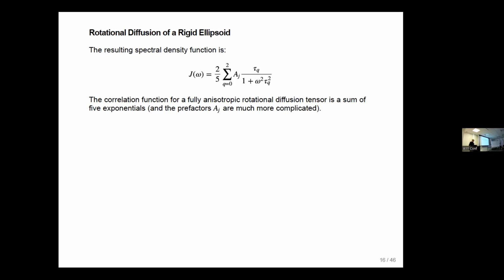And one of the things you can do at low field is do a TOCSY experiment that works spectacularly well, because now the J couplings really are strong coupling. So Fabien Ferrage in Paris has a machine where he can shuttle to a low frequency, do a TOCSY, and then come back to high frequency for measuring the spectrum.